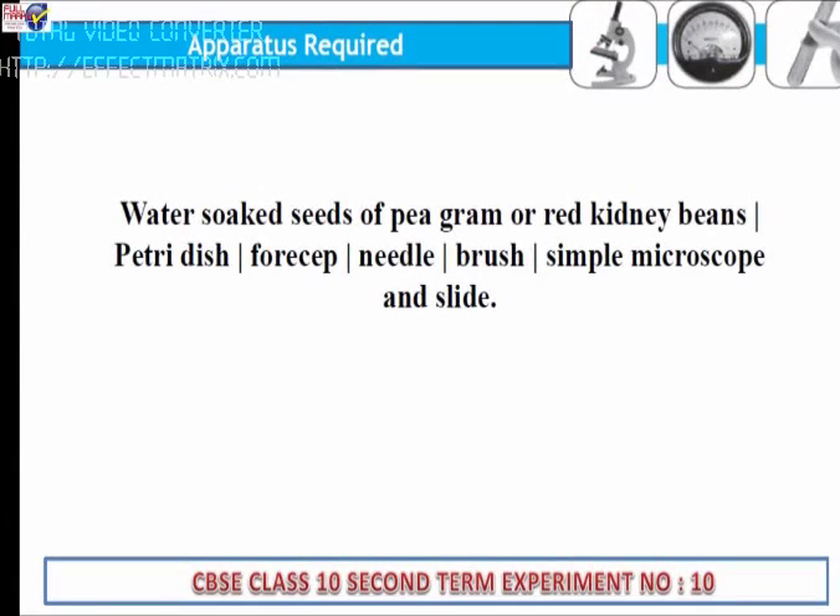Apparatus required: water-soaked seeds of pea, gram, or red kidney beans; petri dish; forcep; needle; brush; simple microscope and slide.